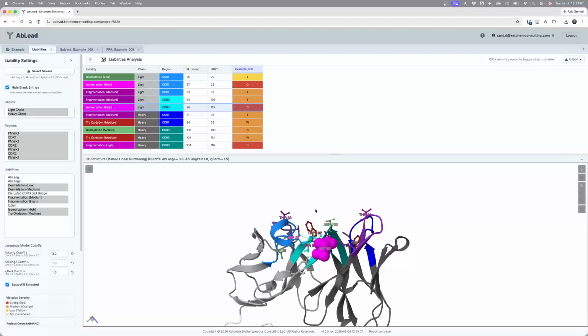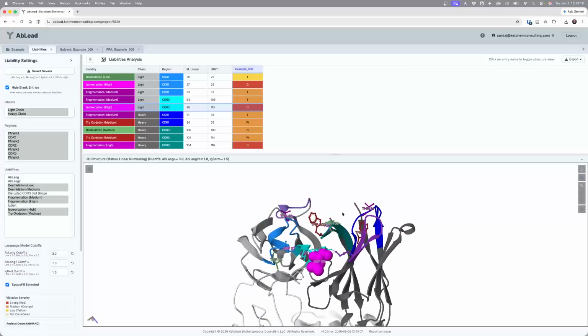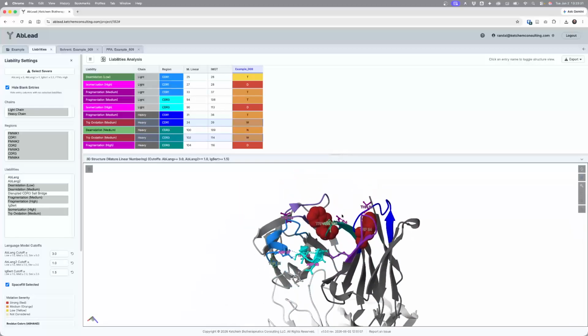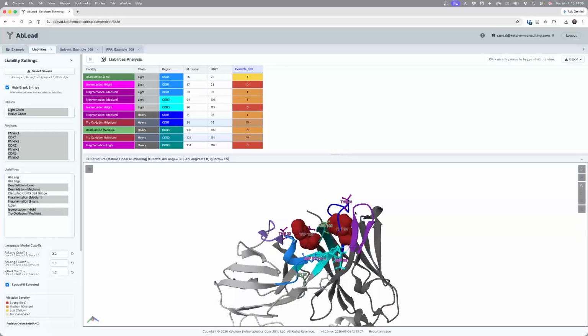So I've made my decisions. Again, I would spend much more time, do much more nuance. I might indeed change these combinatorially depending on the design space that I had available to me. But in this case, I'm not going to modify these. There is a non-severe position that I like to evaluate, and it's these tryptophans. They are notoriously difficult to modify. They do cause hydrophobicity.